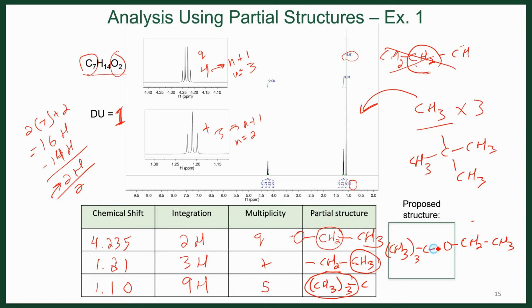So it's most likely that this is attached to a carbonyl, and we have our ester group here associated with this. If I can draw less sloppily a better structure for this in the stick figure on, that would be a proposed structure that would fit all of the NMR data associated with this particular signal. All right.